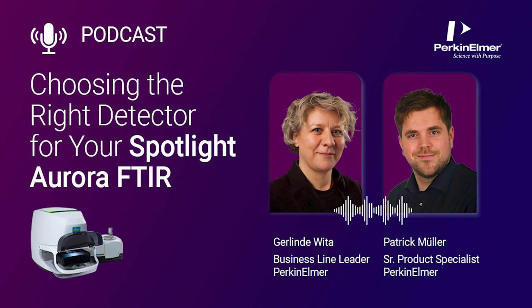So first of all, the size of the sample directly relates to the sensitivity of the detector. You need to choose the most sensitive detector for the smallest sample size. Meaning in this case, for example, you would choose the liquid nitrogen cooled MCT detector if you need the smallest sample size. There's other options then, as mentioned, a second variety of MCT, which is thermoelectrically cooled, which has a little bit less sensitivity. And between these, you can choose regarding the size of your sample.